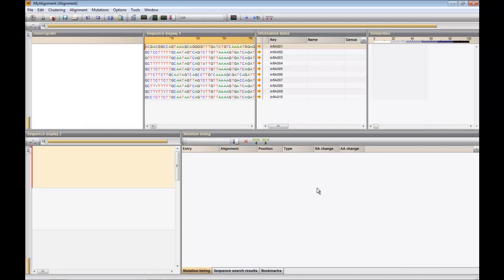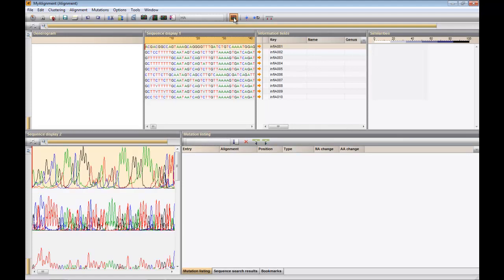We can display the raw chromatogram files of our sequences by pressing this button. If the original trace files were imported via Assembler, they will be shown in the second display panel.